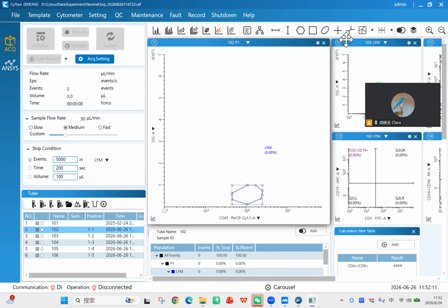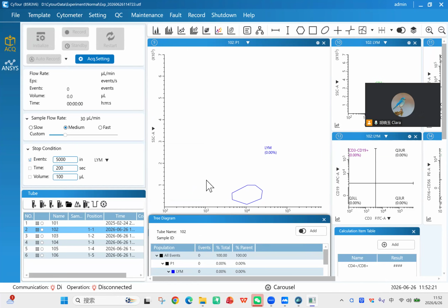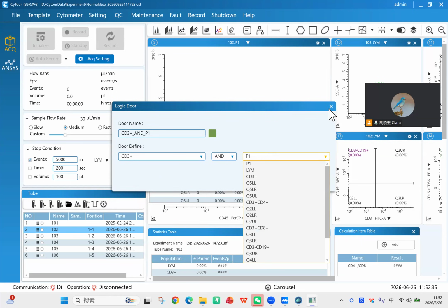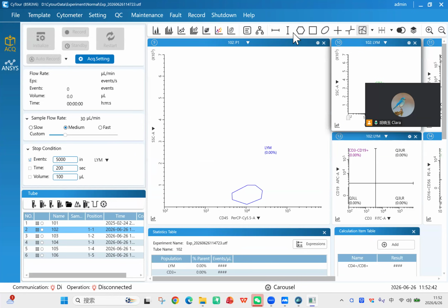And in the lymphocyte gate, we gate the CD3. So diagram like here. CD3 comes from lymphocyte, which comes from P1. And add means you can add two groups together if the doctor needs. Yes. And then these are different shapes of gates.